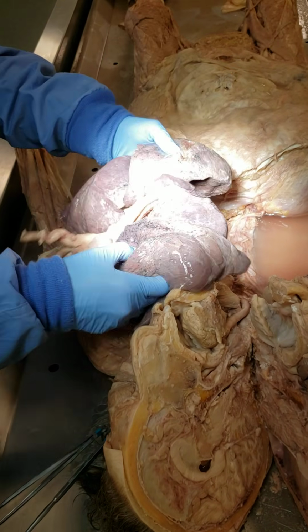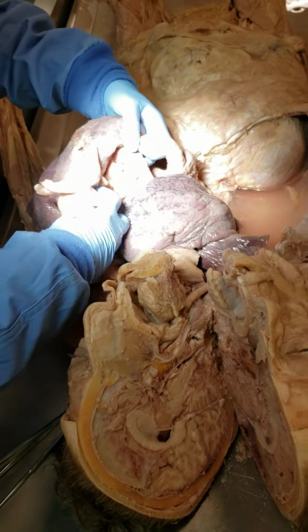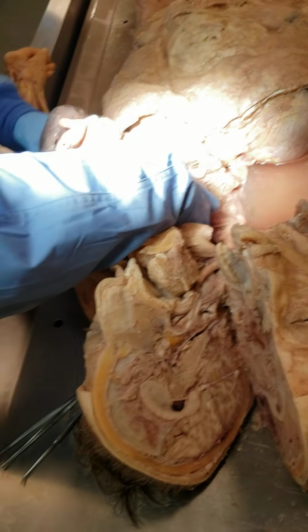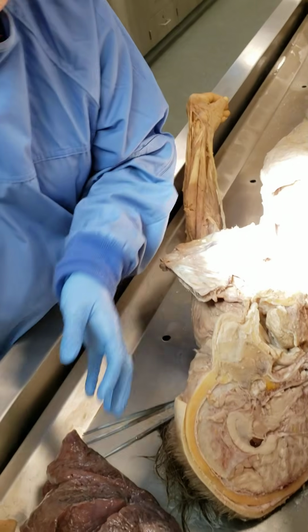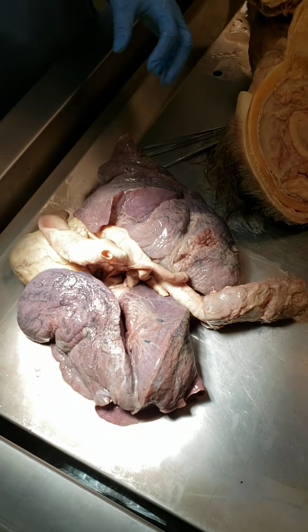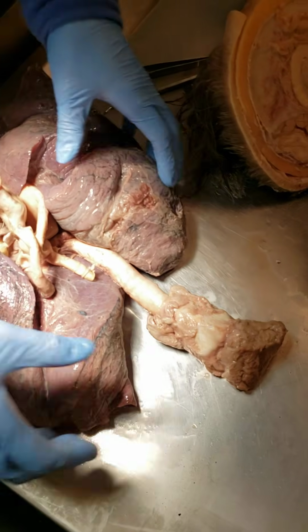Okay, so if we move our focus to the lungs, all right? Let me see. I just want to orient my specimen as best as I can. So, let me do this. So I'm going to move my heart and lungs, okay, and trachea right over here.